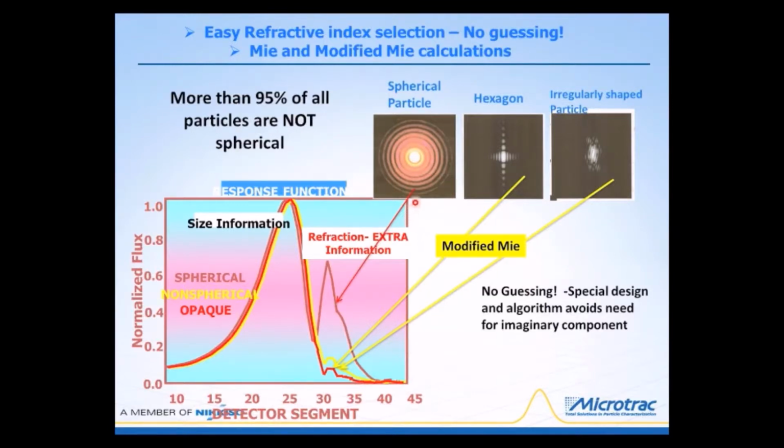Now, up here, if we look at these photographs, this is the diffraction pattern that you would find from a spherical particle, and you'll notice that there's a series of light rings, dark rings, light rings, dark rings, etc., and that goes off into infinity. But this is the basic pattern, and we must do calculations to account for how this pattern develops, as well as any refractive component.